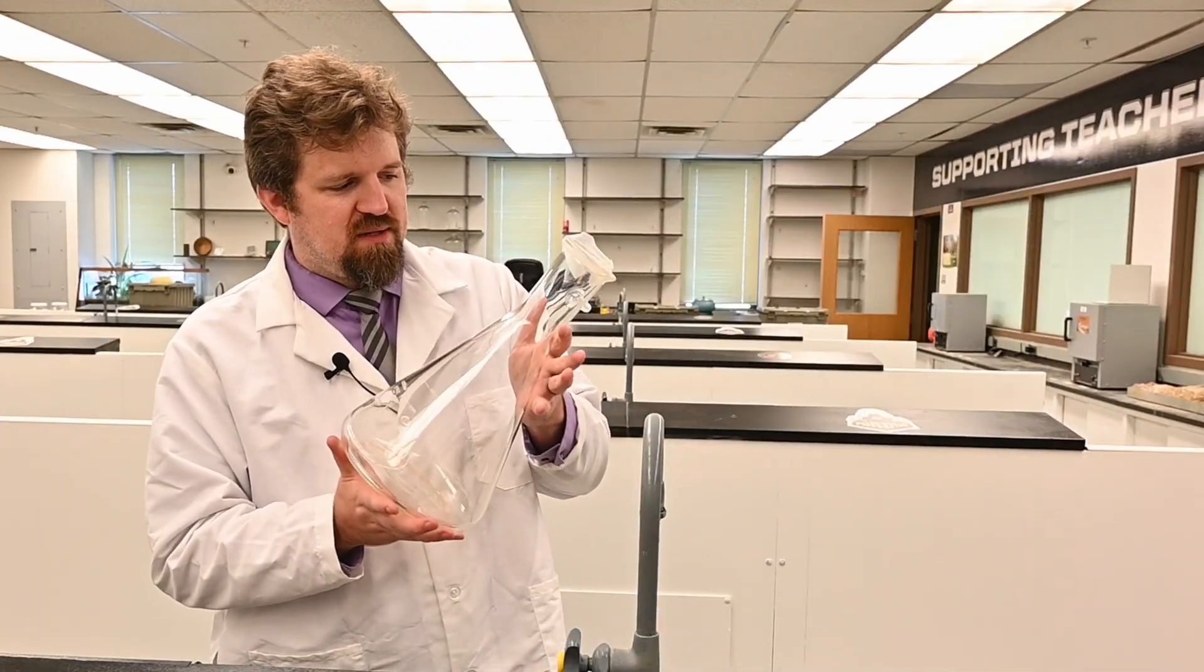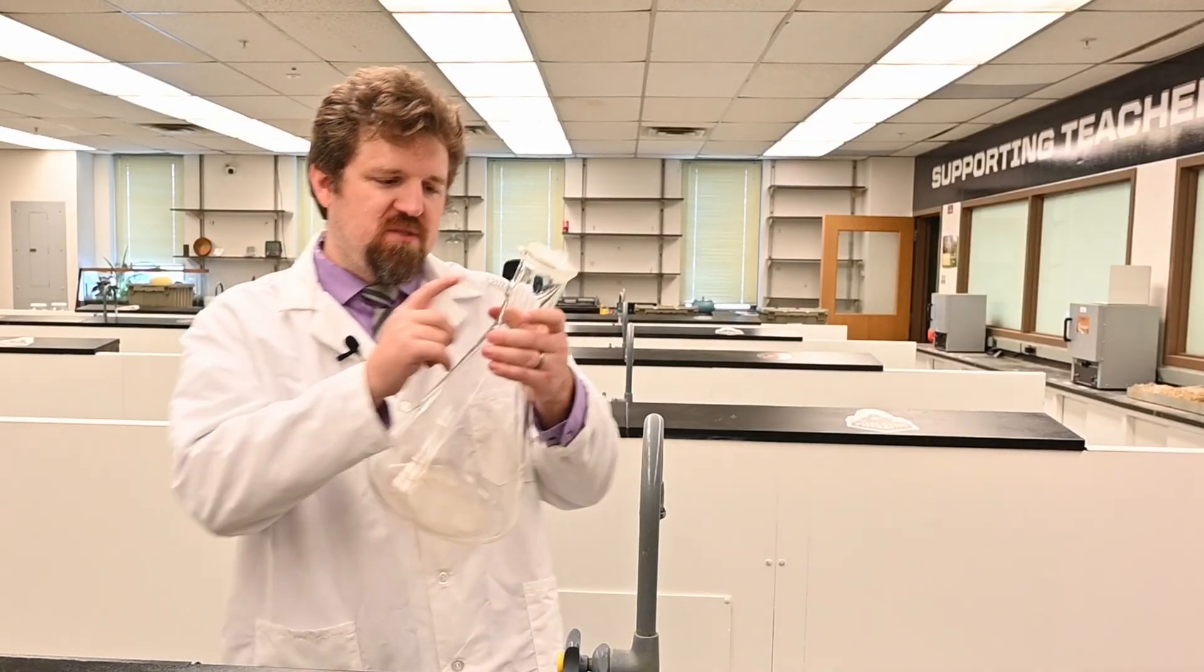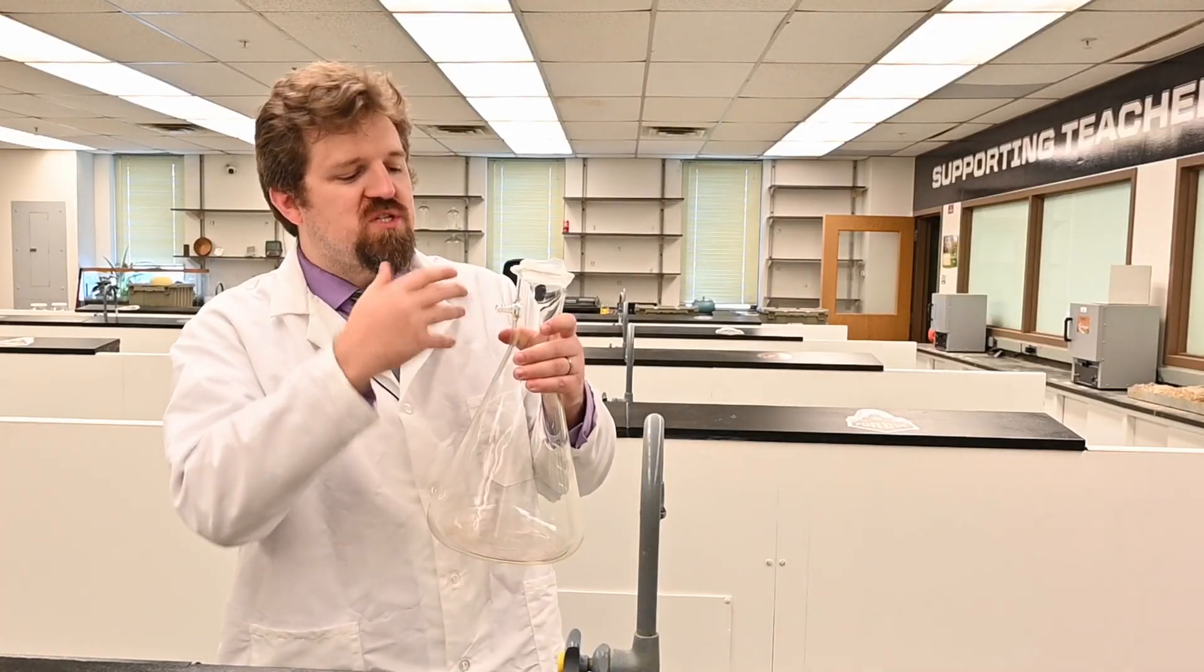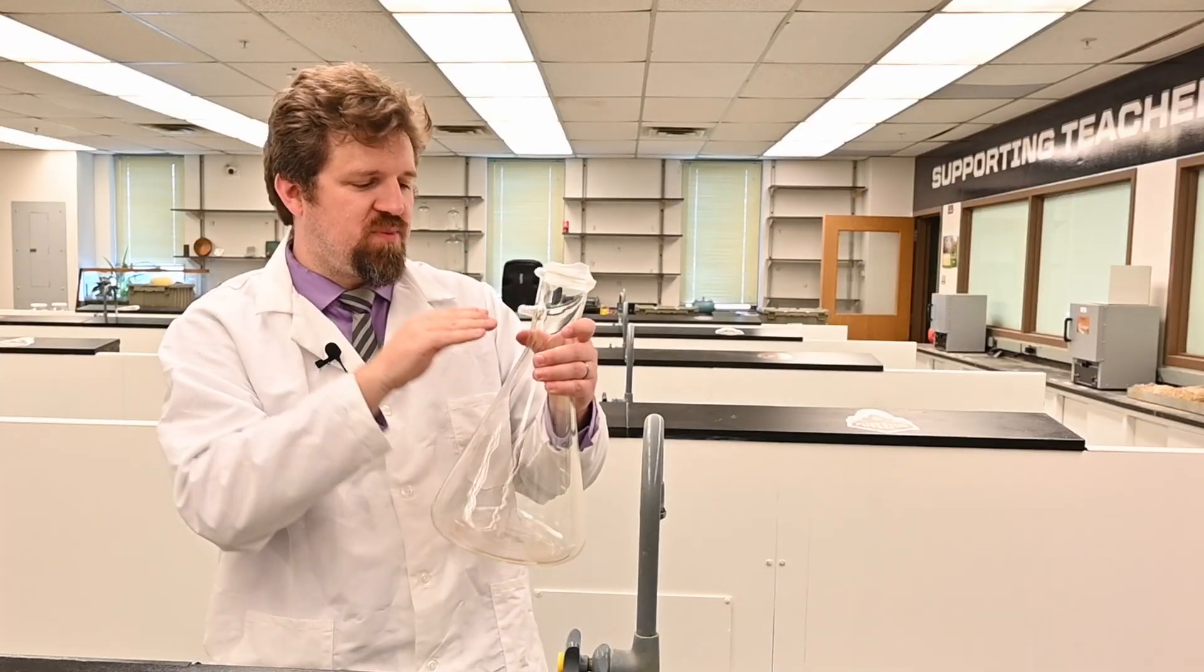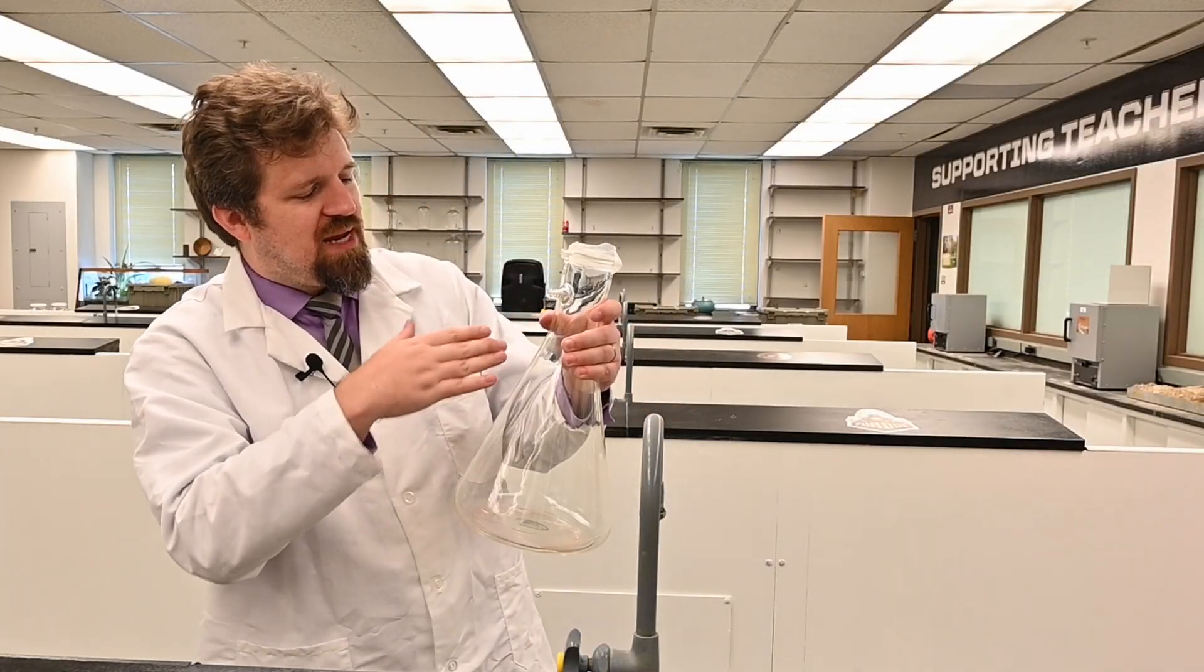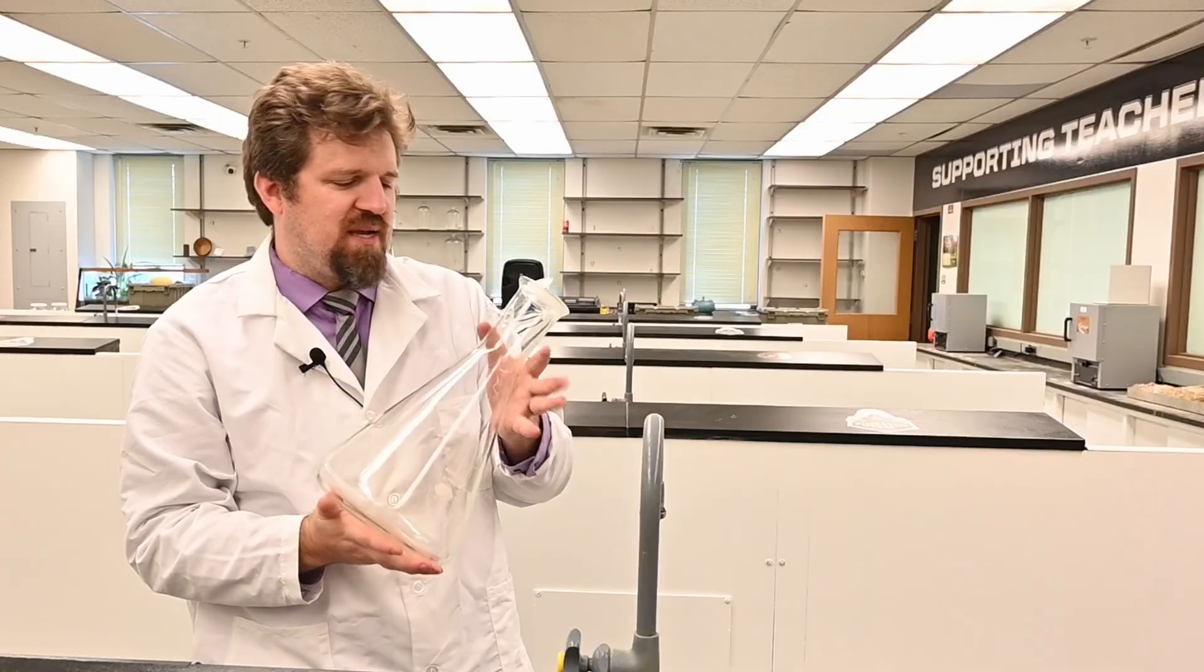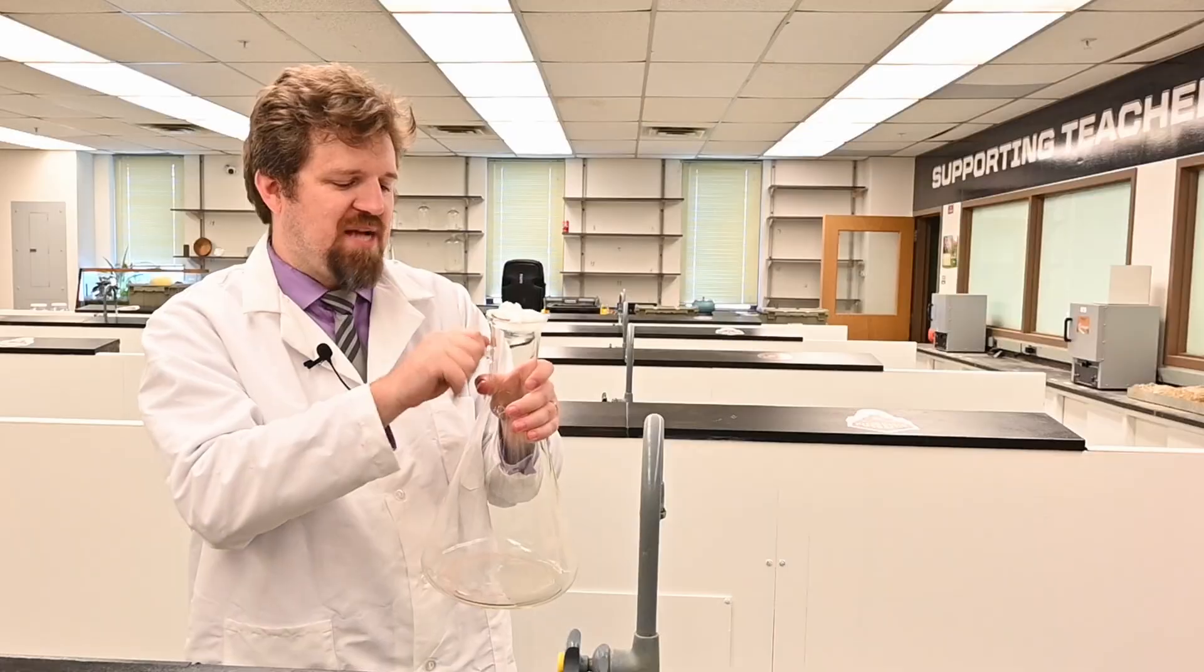I do want to take a moment to talk about this big boy here. This is a four liter Erlenmeyer flask, but you'll notice this weird little thing on the end. Well, what this is, is you can attach a air hose to this and then use something to draw a vacuum on it. And so as the fluid rushes by, because of Bernoulli's principle, it lowers the pressure. The moving fluid has a lower pressure. And so what ends up happening is you can actually draw air out of this, which then will draw air through the top. And you can use this to really quickly vacuum filter things.